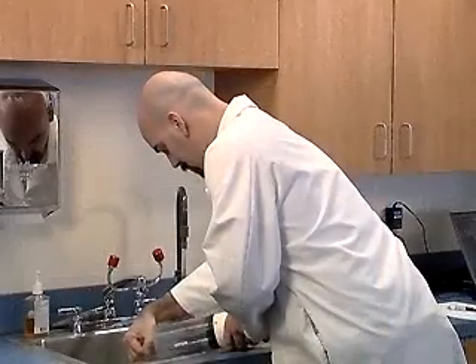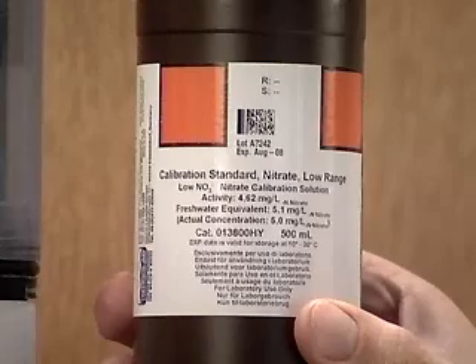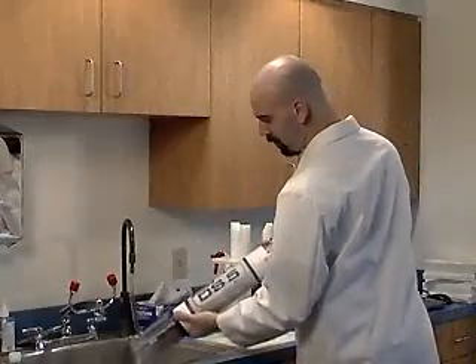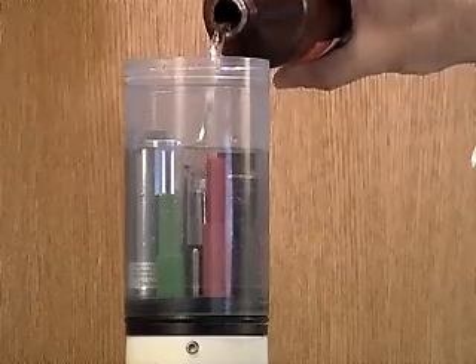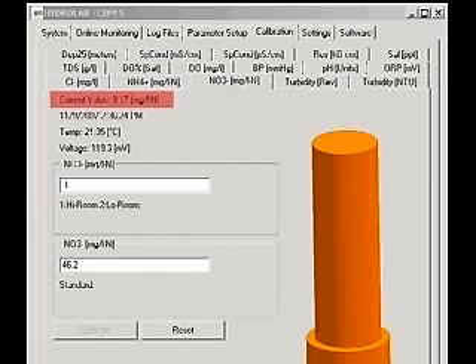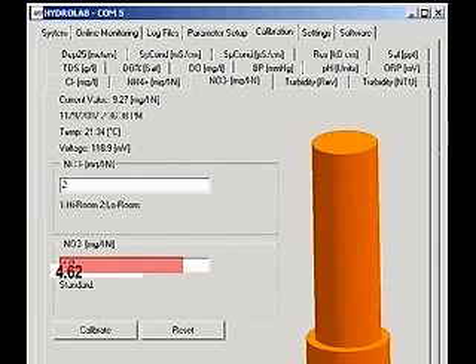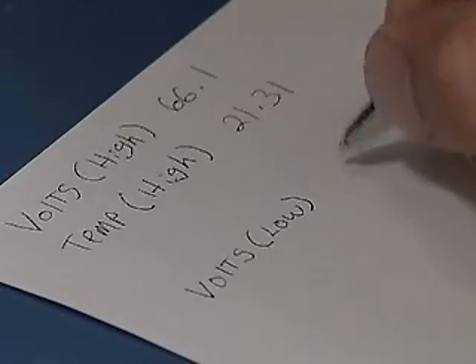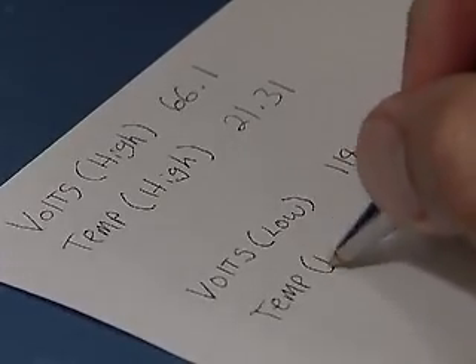Rinse the cup and sensors with deionized water and dry them. Fill the cup about 25% with the Room Temperature Low Standard and screw the storage cap on. Shake for 6 seconds. Remove the storage cap and pour the standard out. Fill the cup with Room Temperature Low Standard again, this time covering the Ion tip and the pH sensor. Wait 5 minutes for the readings to stabilize. When the readings are stable, type a value of 2 in the first box to designate the low standard. Type 4.62 into the second box and click Calibrate. A calibration successful message will appear. Record the temperature and the voltage reading. The two temperatures must be within 0.5 centigrade of each other for a valid calibration.